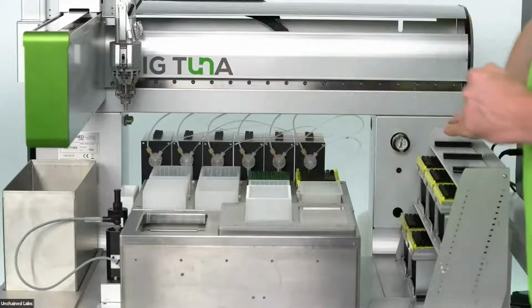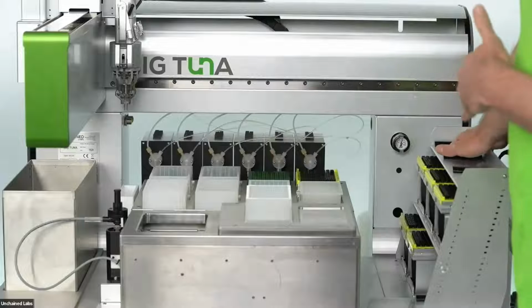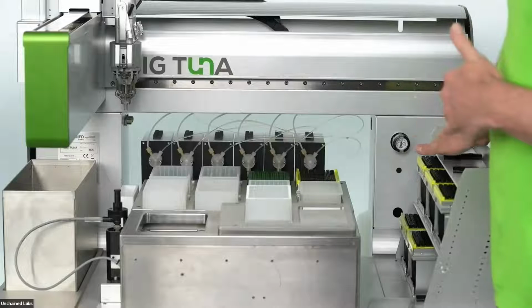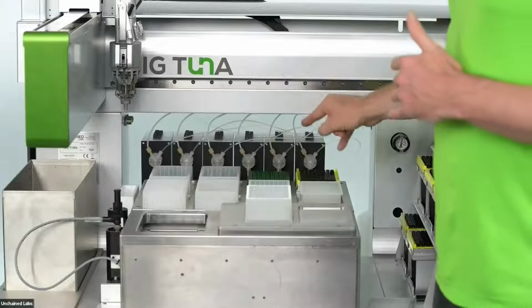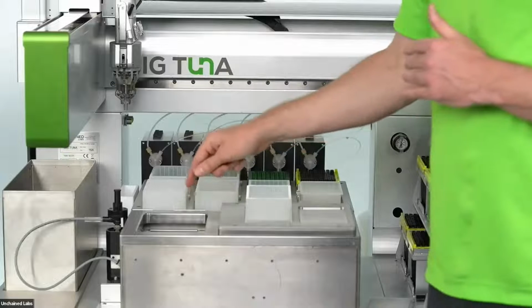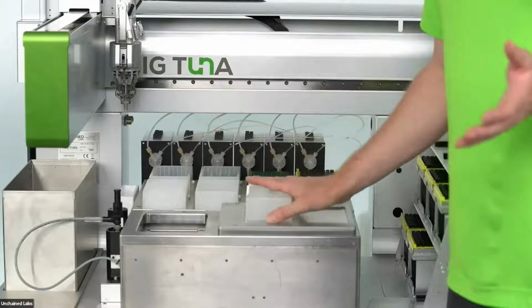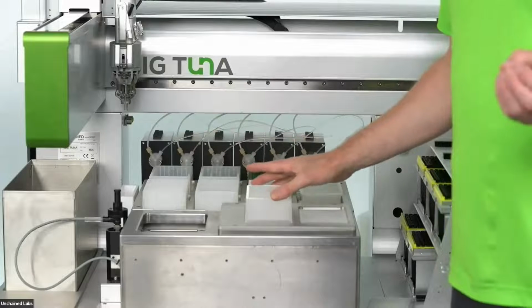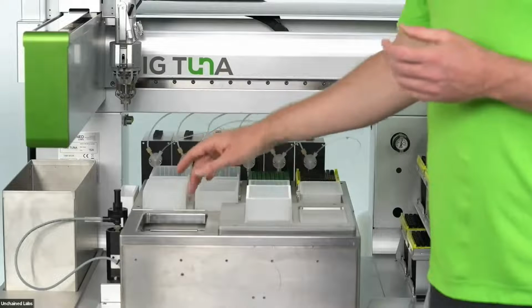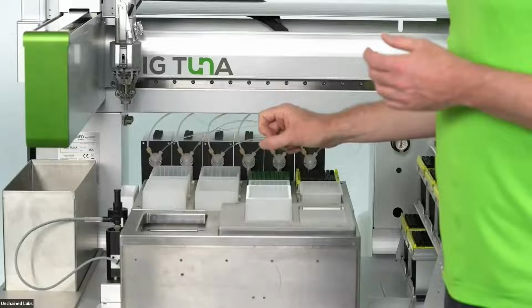And Big Tuna being high throughput, if you're able to see on this side of the screen over here where my hand is, the tip rack hotel. That is where you can store all of the tips. And the transfers that happen is really adding new buffer. If you're doing buffer exchange, or if you're running one of our concentration applications, which we'll see, reduce sample volume, that's the only time that we are transferring sample to the Unfilter as well.